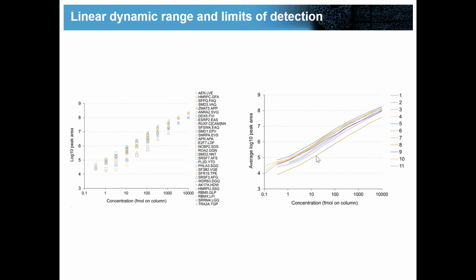And we just published a paper about half a year ago, I guess, where we published an extension of our standard OpenSWATH tool called IPF, Inference of Peptidoforms. And basically what this does is a two-pass analysis. So it first tries to find high quality signals that look like the peptides that they should be in the normal way.